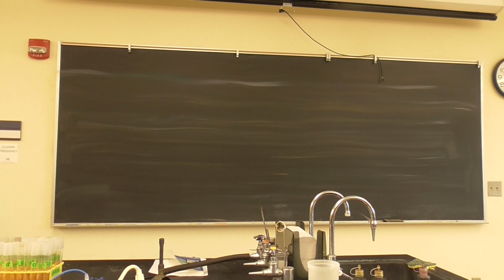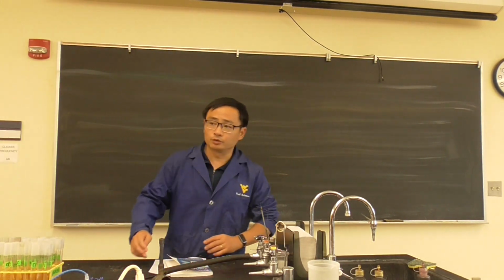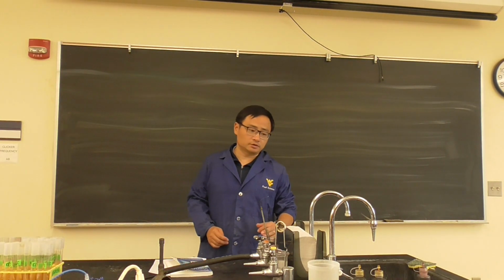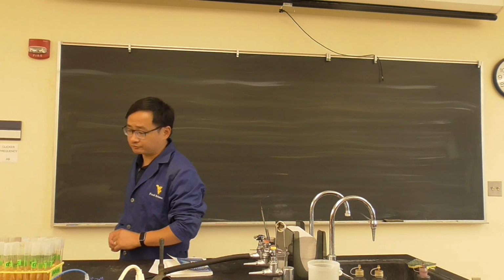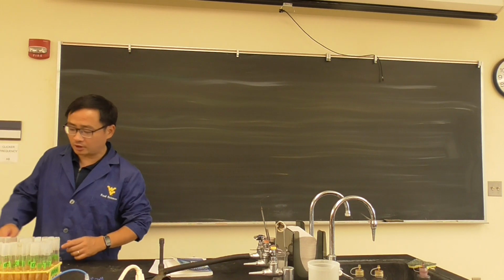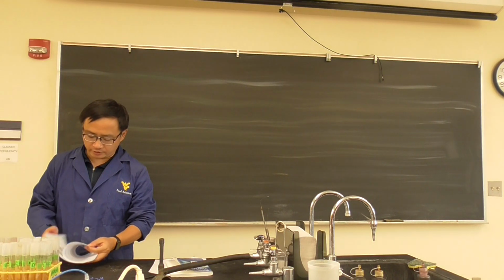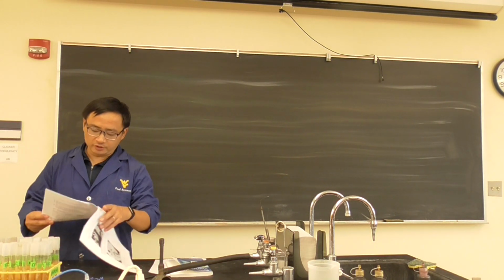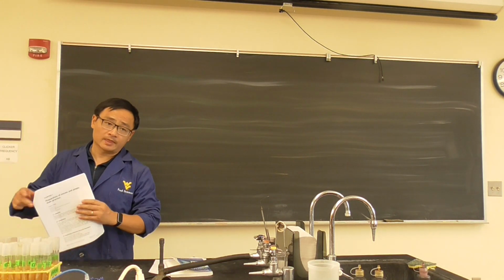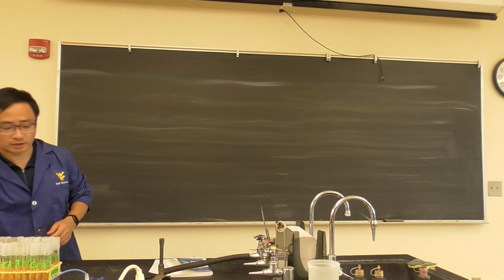Okay, good morning. Let's have a class, and this will be our second lab. We will make our own glass slides and use simple stain to do the observation of the bacteria. There are two different bacteria here, which are E. coli and Lactobacillus, and the corresponding material in the fact sheets you will find is chapter 3, the preparation of the smears and the simple stain technology. So that's what we're going to do.